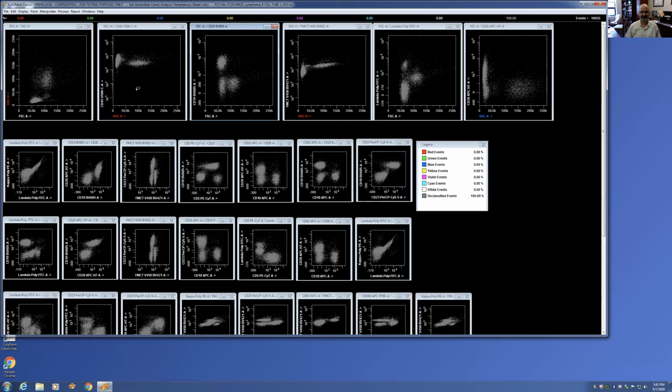This is usually the favorite dot plot of flow cytometry labs, where all the gating begins here. I will suggest we should do it a different way. Here's forward scatter versus side scatter. You see the lymphocyte cluster. These are your monocytes. This is granulocyte, seems like a blood specimen, and it has come in for a lymphoma evaluation. So the way we do it is we can pick any color. So let's say I pick color red, and there are three primary colors here, red, green, and blue.